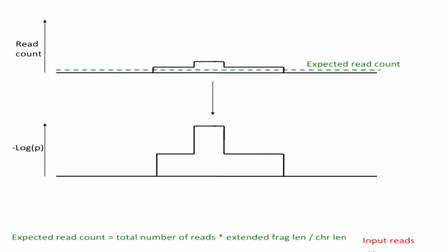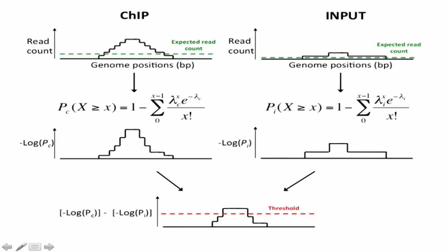So essentially removing one log 10 p-value from another, right? And that allows you essentially to reduce the size of the peaks in the ChIP data using information about the input data, right? And now you are in a sort of controlled, normalized situation where you can look for contiguous nucleotides whose difference between log 10 p-values is above a threshold, right? And we look for these regions here, right?